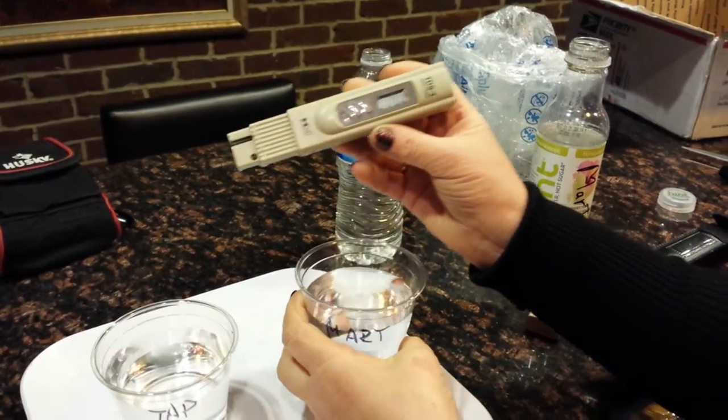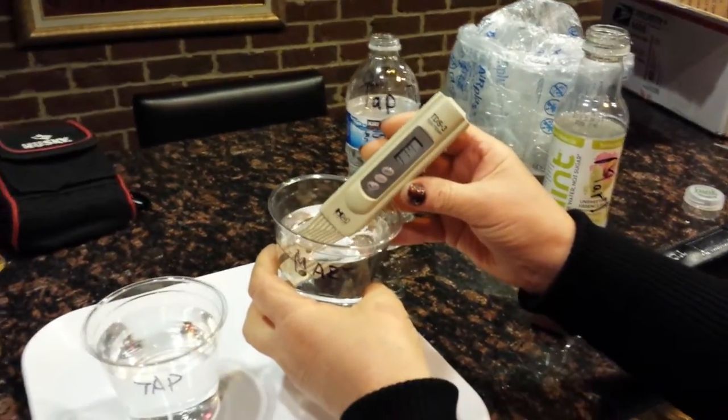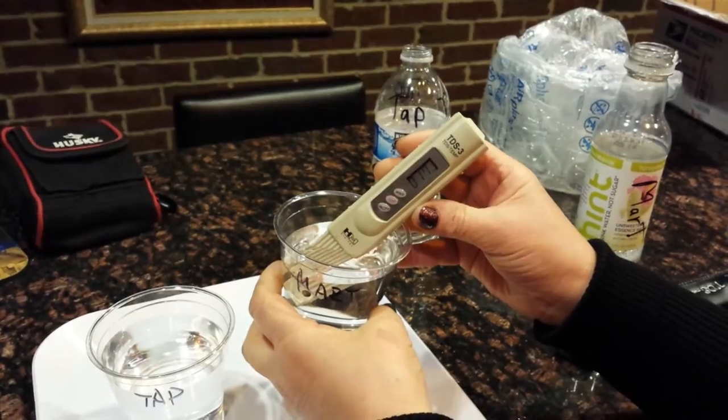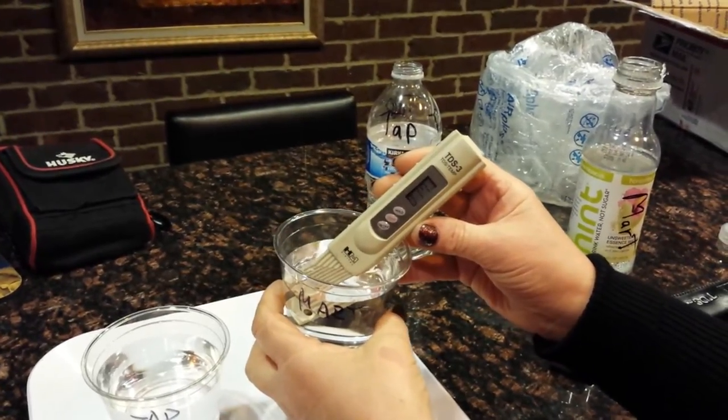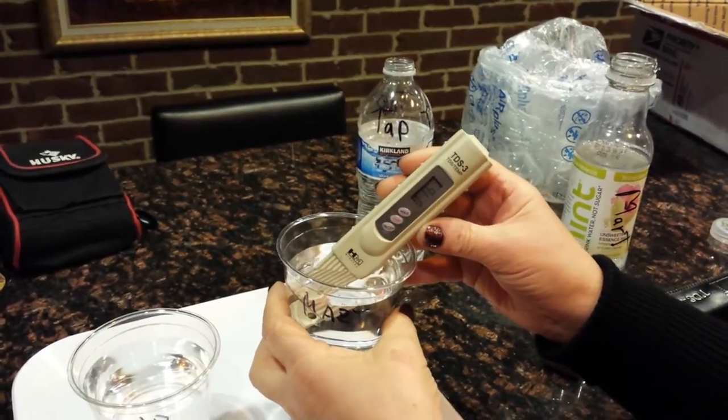Now mart water — you see zero here? Yes, zero. That's the water he buys. It's okay, we'll see. It reads 17. Allowed number is 0 to 10, but here it is 17.